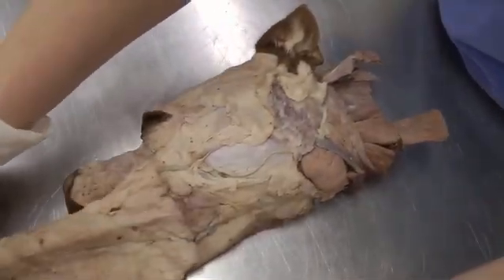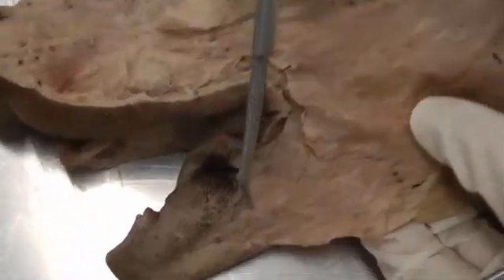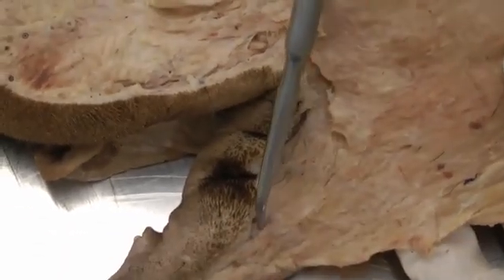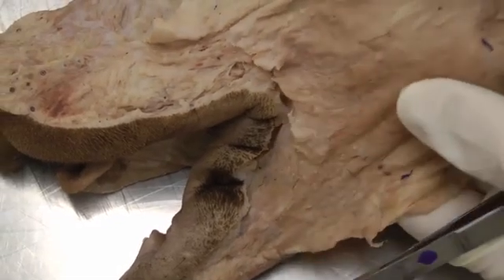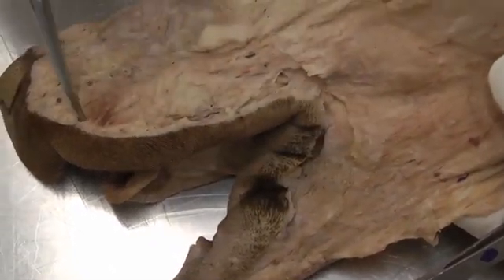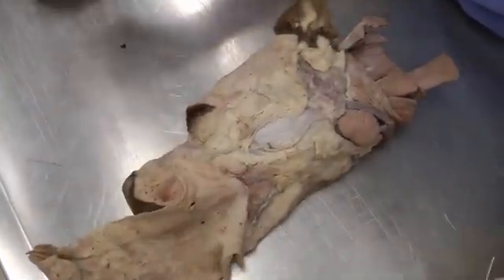Reflect the platysma rostrally. Note that right here, cutaneously, you can see fibers running around the mouth — those are called the orbicularis oris. The platysma, which are the straight fibers, tie right into that. So orbicularis oris goes around the mouth and platysma goes straight back. Then reflect the platysma rostrally.